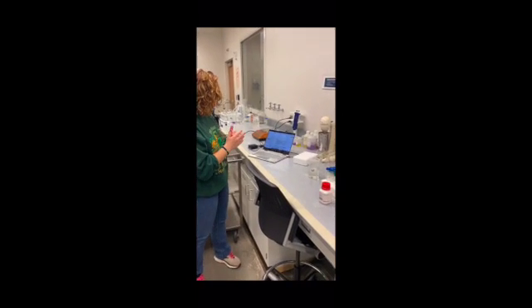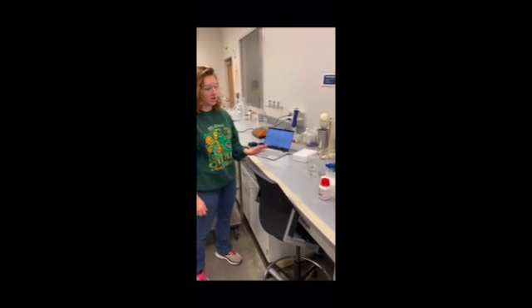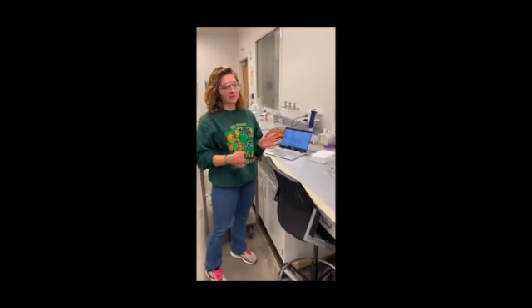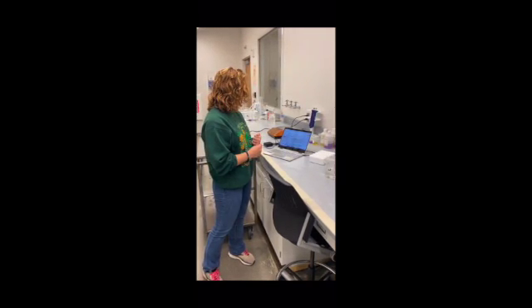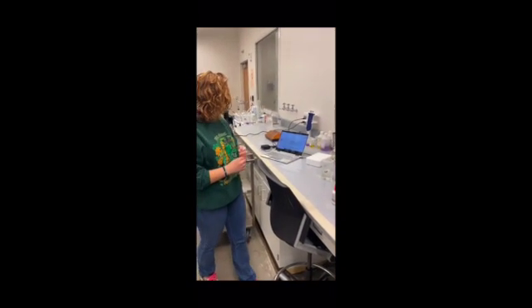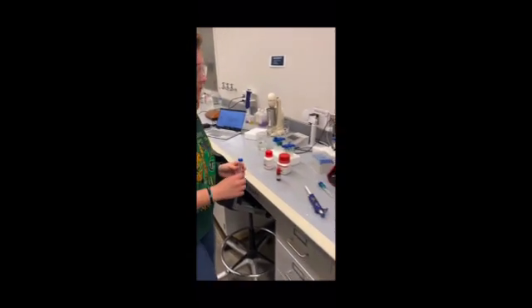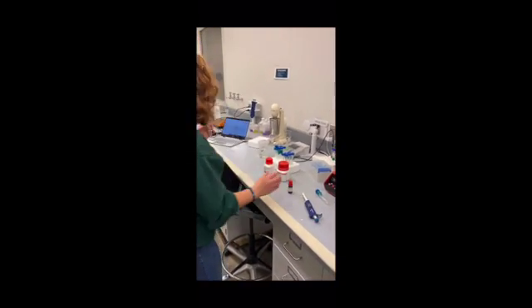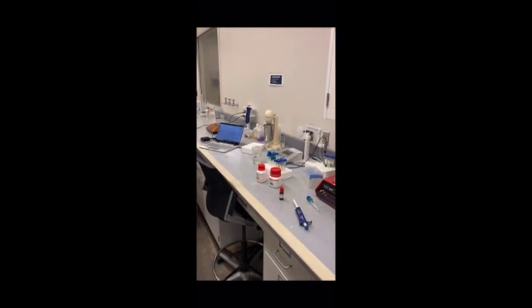And then next up, for our actual measuring of the absorbency for the rest of the solutions, we would start with one of the room temperature solutions. And then we would add some of the enzyme dilution, so 0.5 milliliters of the enzyme to the solution.